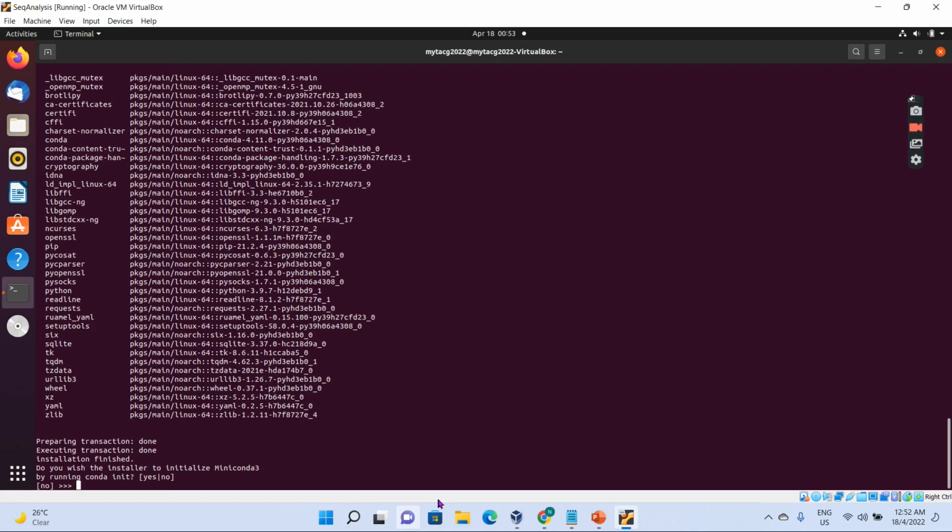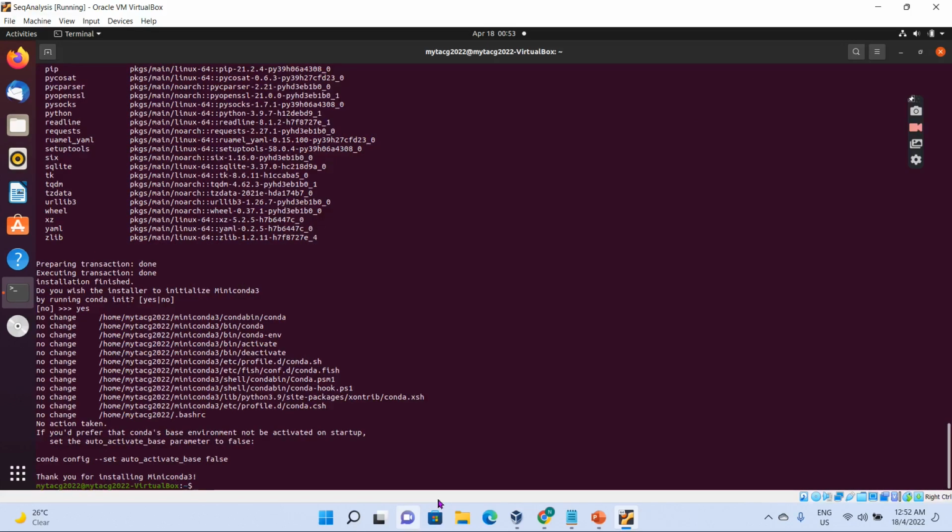Just type yes to agree to the initialization. So done. We have already installed the Bioconda or the miniconda.